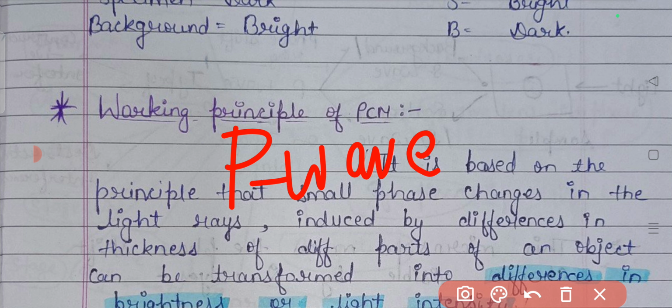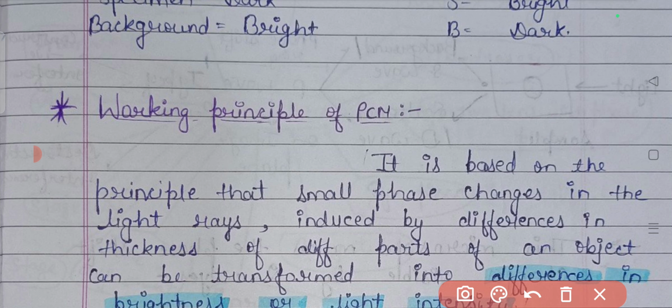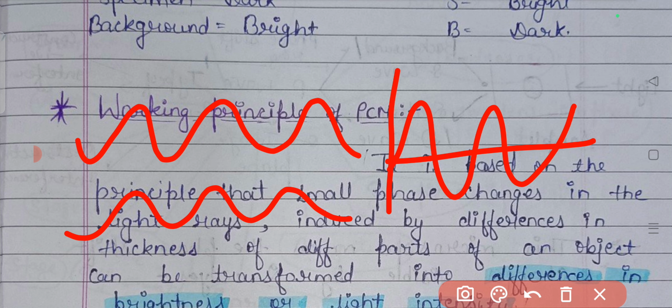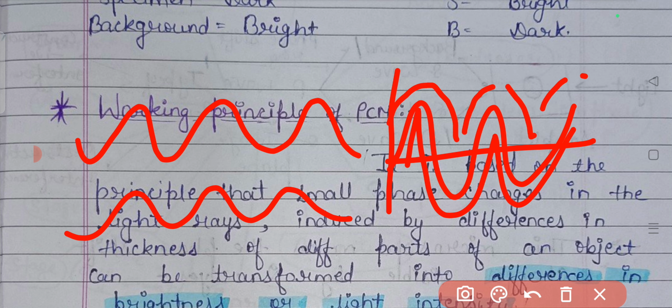The P wave is a mixture of the D wave, the diffracted wave of the sample or specimen, plus the S wave, the surrounding wave of the background. So the P wave will be generated after the light rays pass through the phase shift ring. This is the background light, this is the specimen light, and as a result a wave will be presented here, the P wave, a mixture of D and S waves.